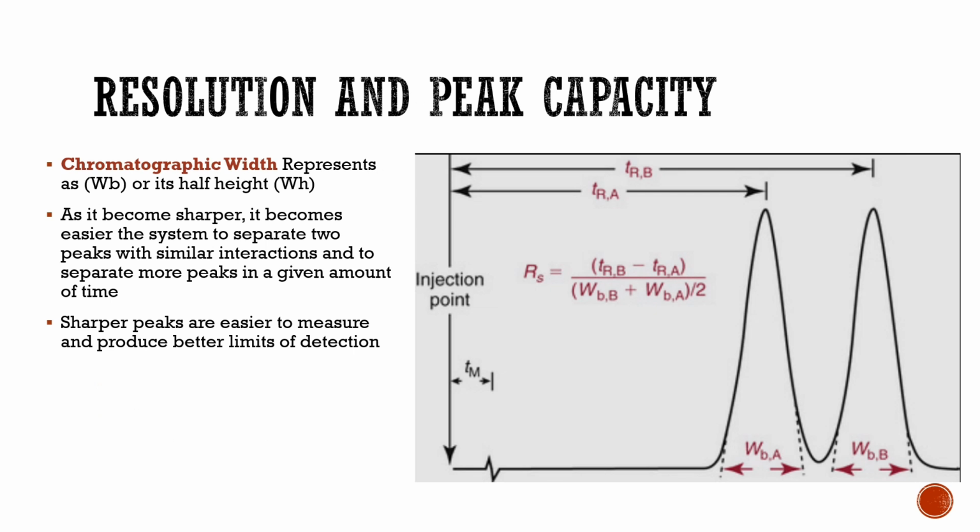So these are the factors in practice that will affect the separation and the chromatographic width.